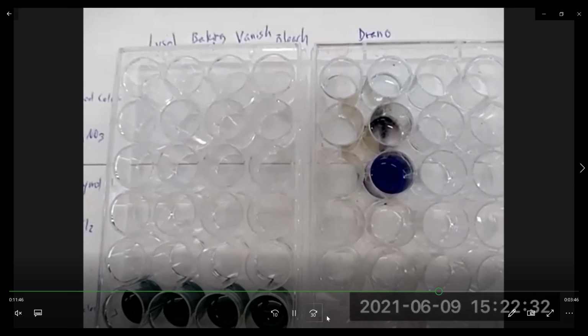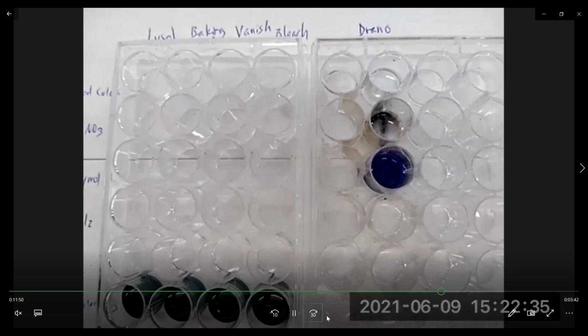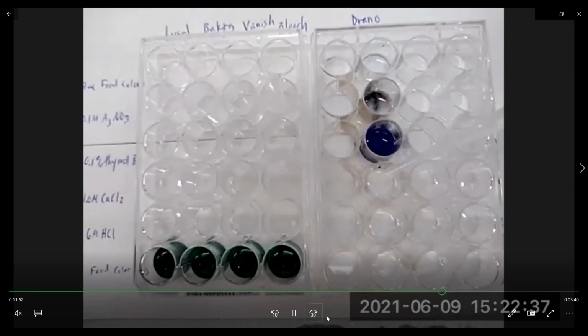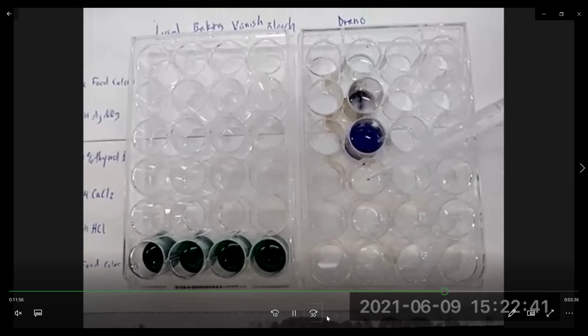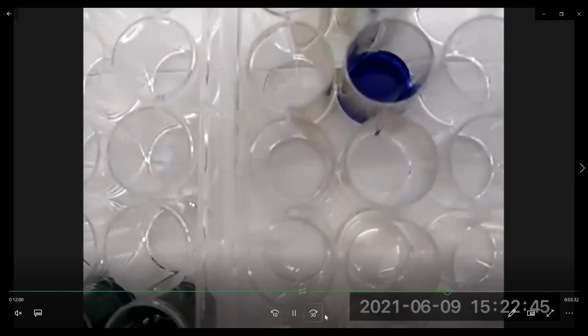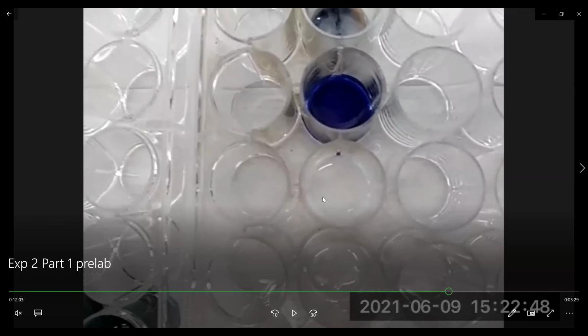So far, we've seen 3 reactions with the Drano. Next, we're going to add calcium chloride. And you can see here that the calcium chloride forms a cloudy white solution.